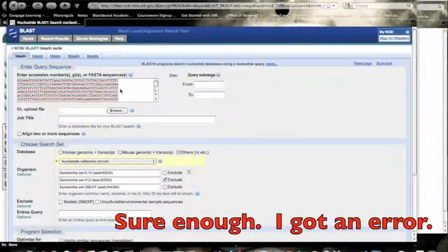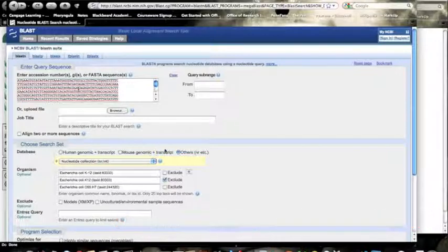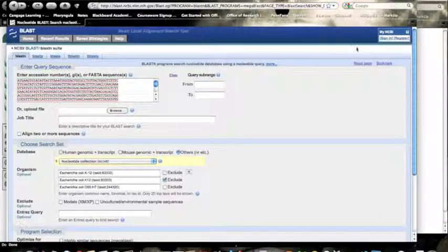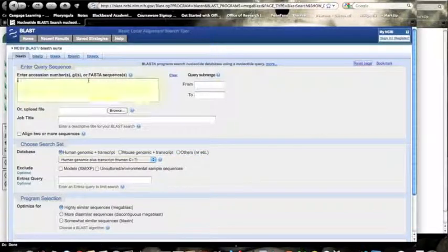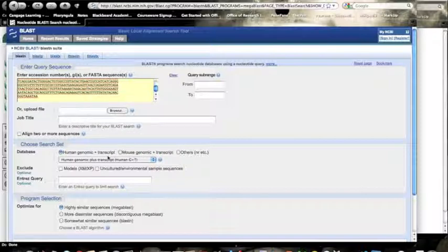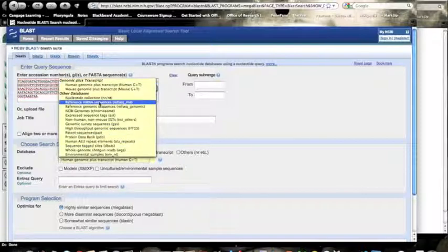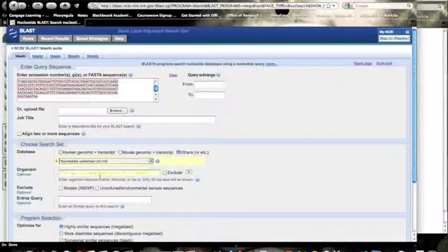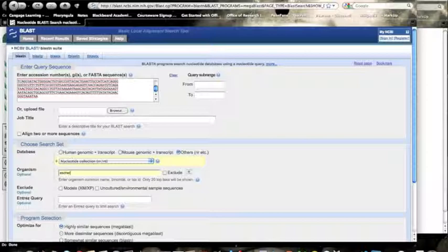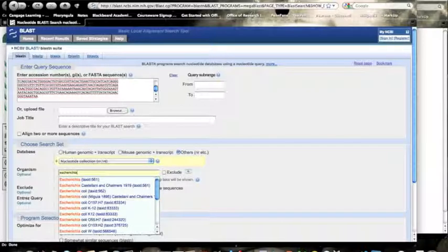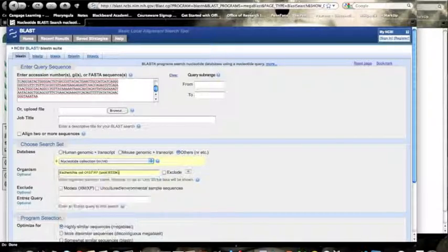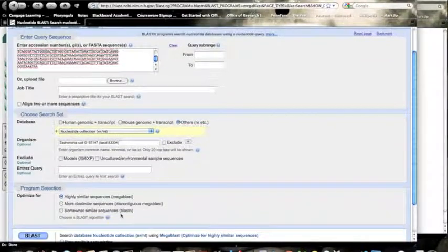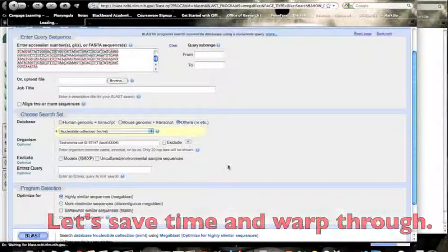Now, to do our positive control, we put in the sequence, and we'll just want to put in the pathogenic strain of E. coli. And there it is. Put that in. Look for highly similar sequences, because it should be in there. And there's our answer.